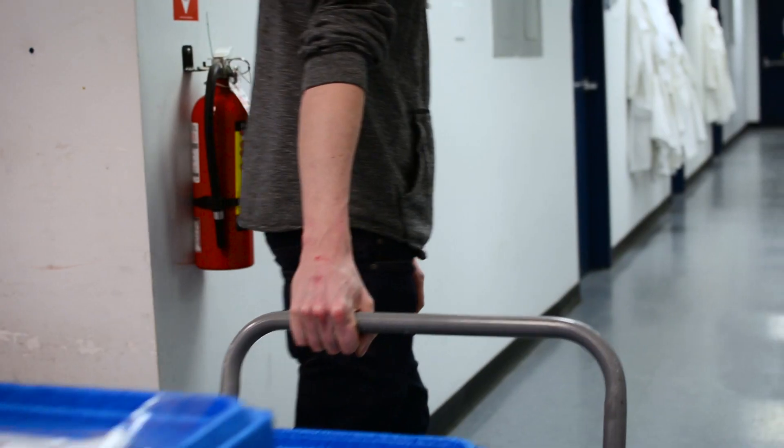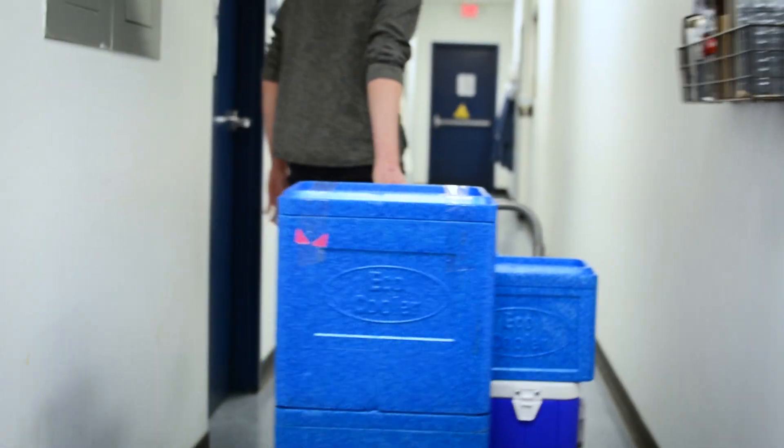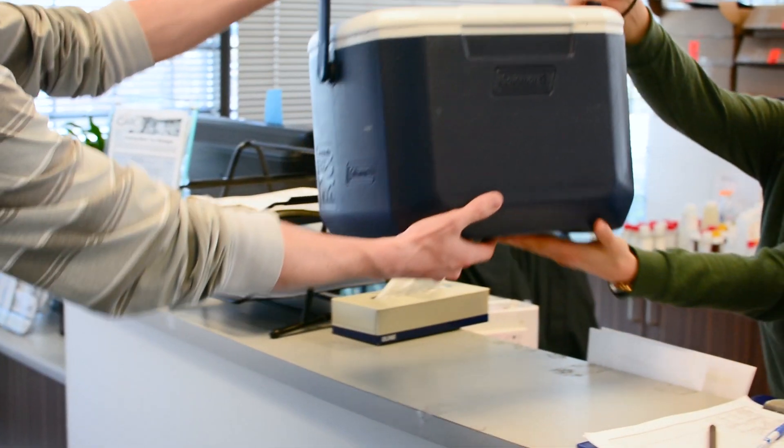A very common question we get is: how do I get my samples back to Caro? Once the containers are filled up, ship the cooler back to our lab. You can use your preferred courier or the post office.